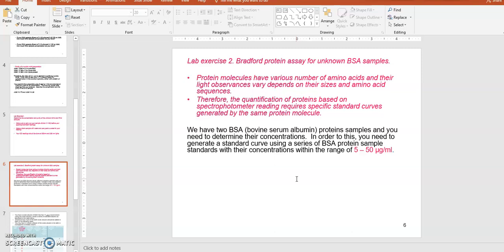That's possible because for DNA and RNA, there isn't much structure variation among their sequences, because they are made up of nucleotides. DNA with GATC, only 4 nucleotides. RNA with GAUC, only 4 nucleotides. So there isn't much variation in their absorption capability, right?